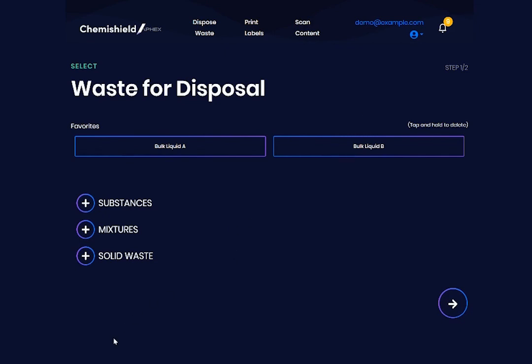I hope you found this pre-recorded demo useful in terms of understanding what Chemishield is and the benefits that it can offer both technicians, managers, and disposal operators. Thank you.